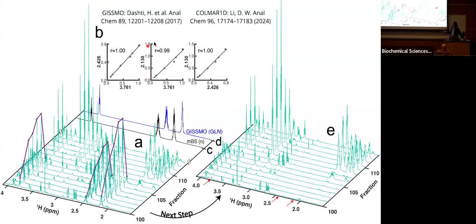They are well correlated together up here, quantitatively, essentially perfect correlations. If you're used to it, Jeremy Nicholson published something called STOCSY, Statistical Total Correlation Spectroscopy. This is essentially STOCSY, but across the fractions. The problem is that STOCSY, you usually do it in unfractionated mixtures, and usually a correlation coefficient of 0.8 is what you're pretty happy with, or 0.9 maybe if it's a really good day, never this high. So because of the HPLC and because of the SAND processed peaks, these are essentially perfect correlations.